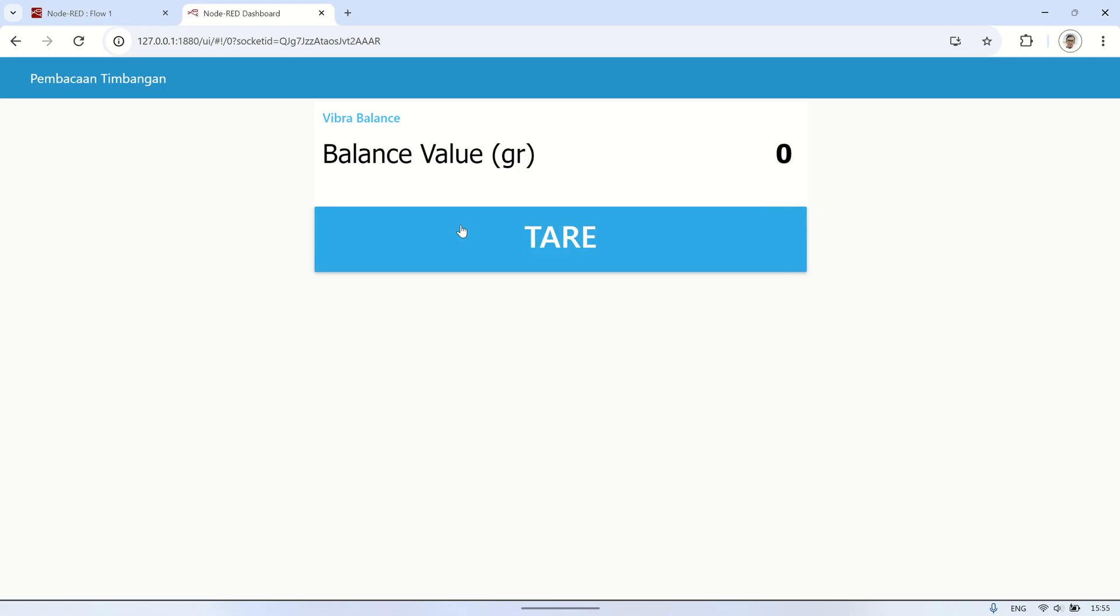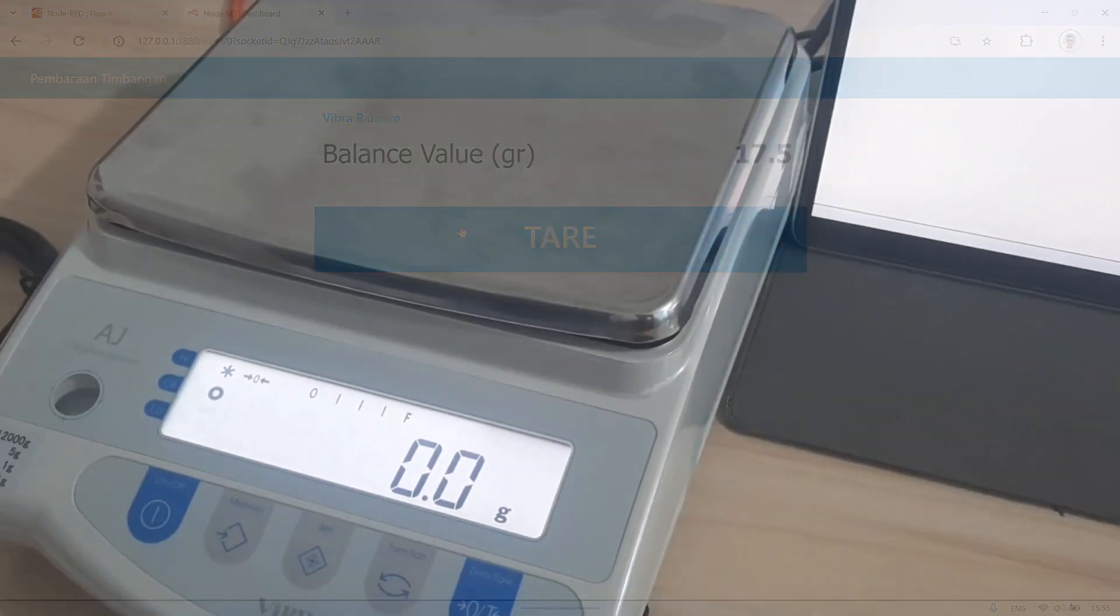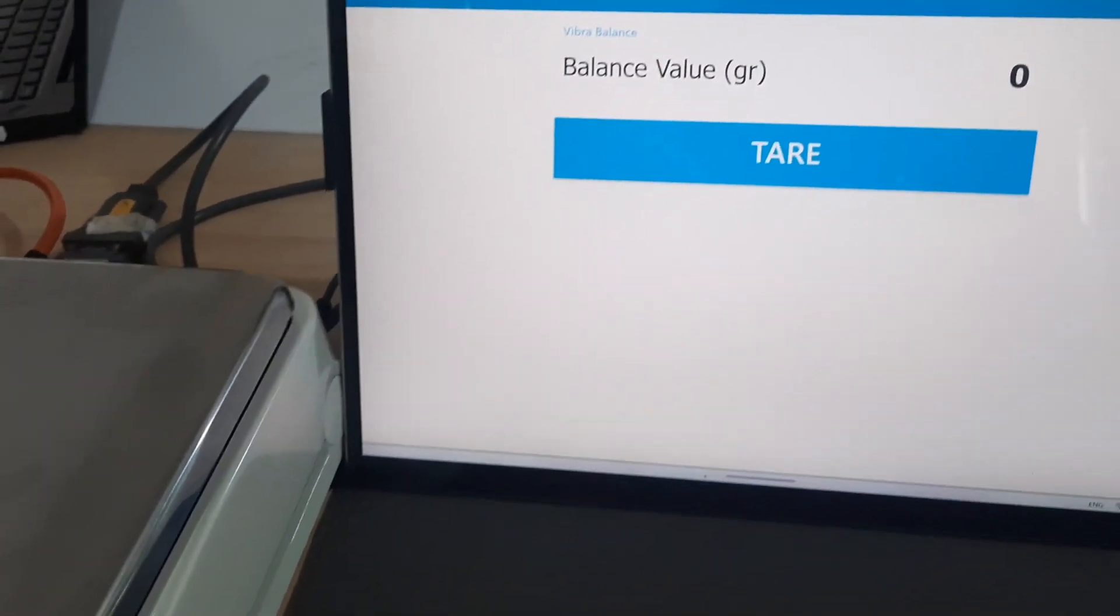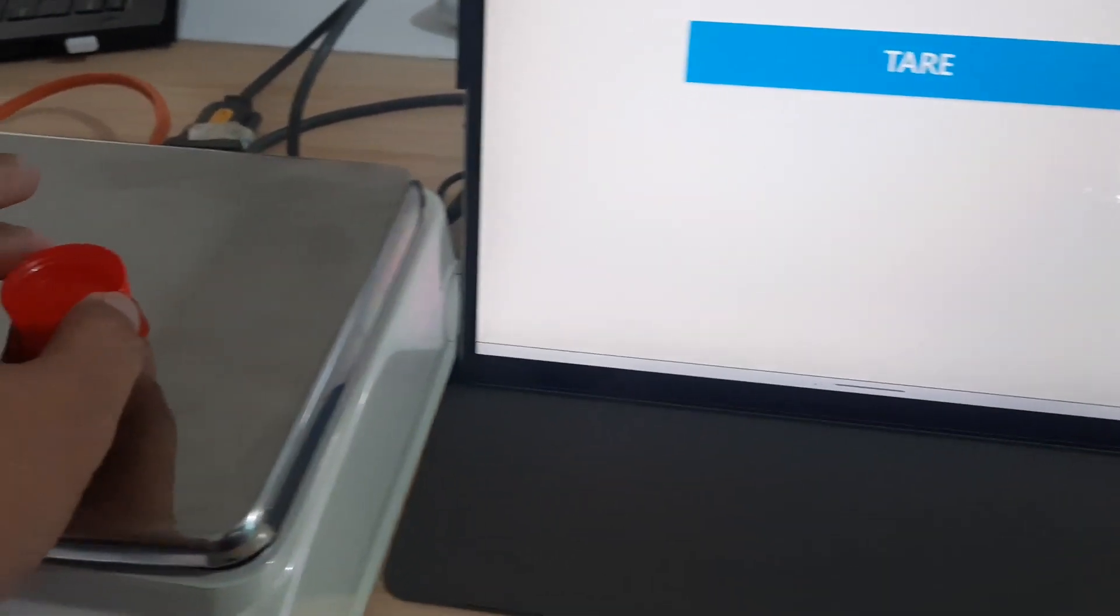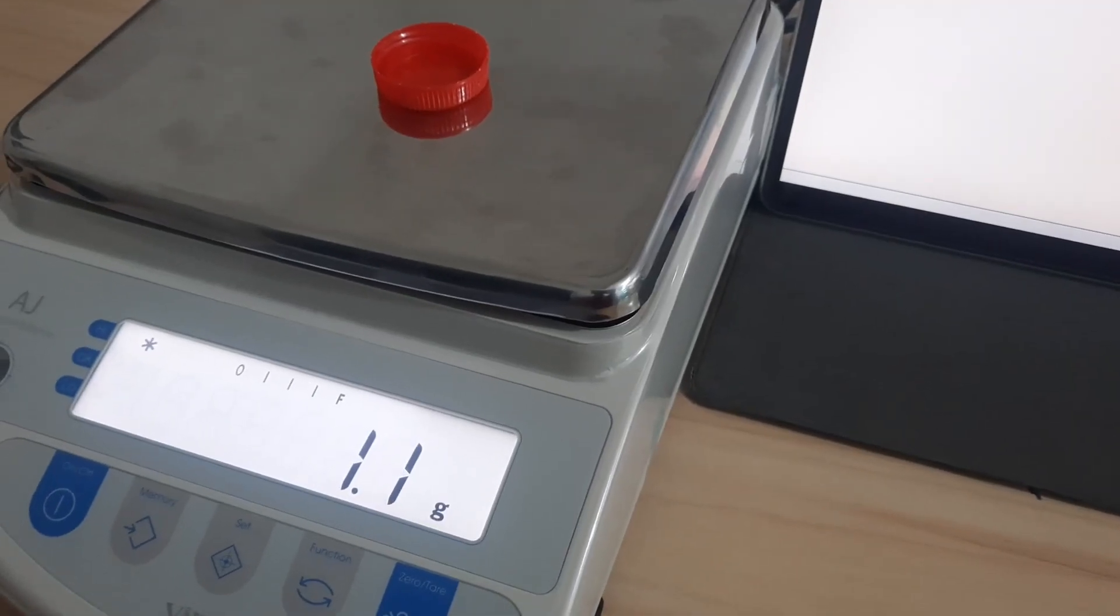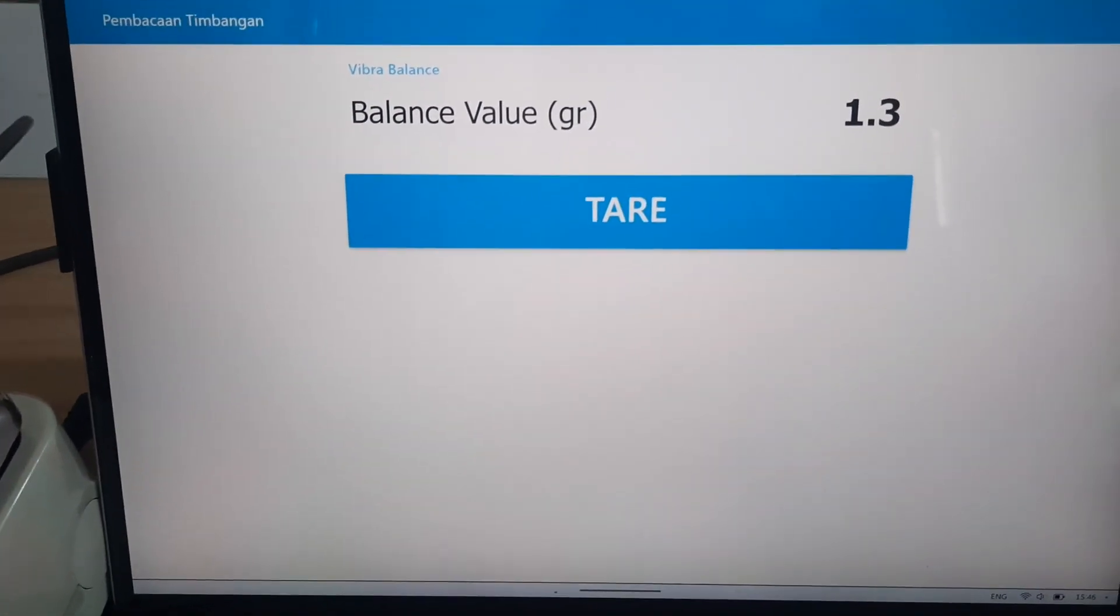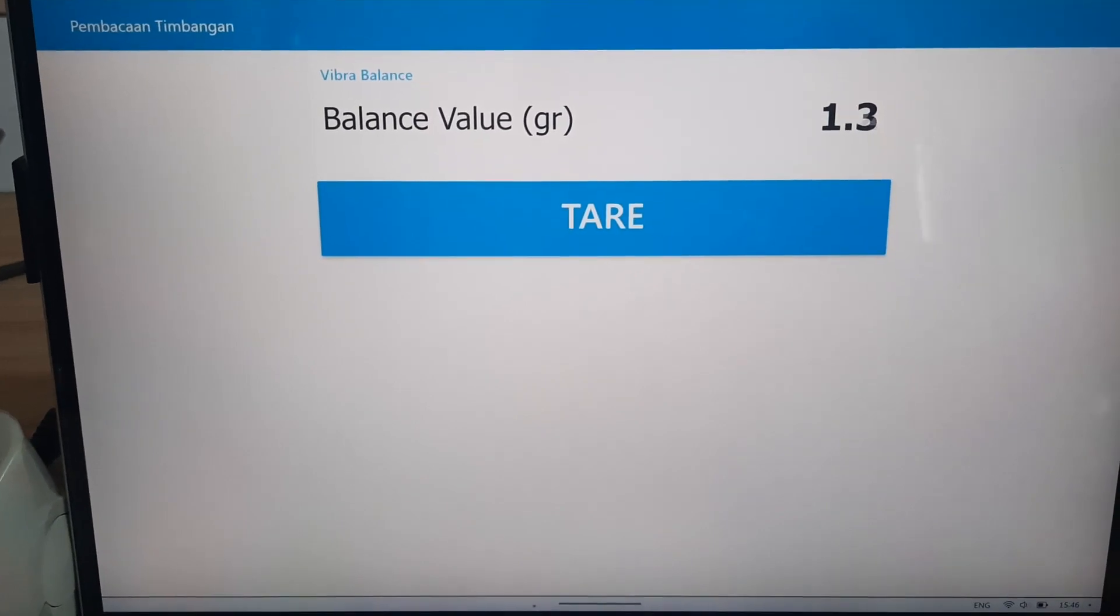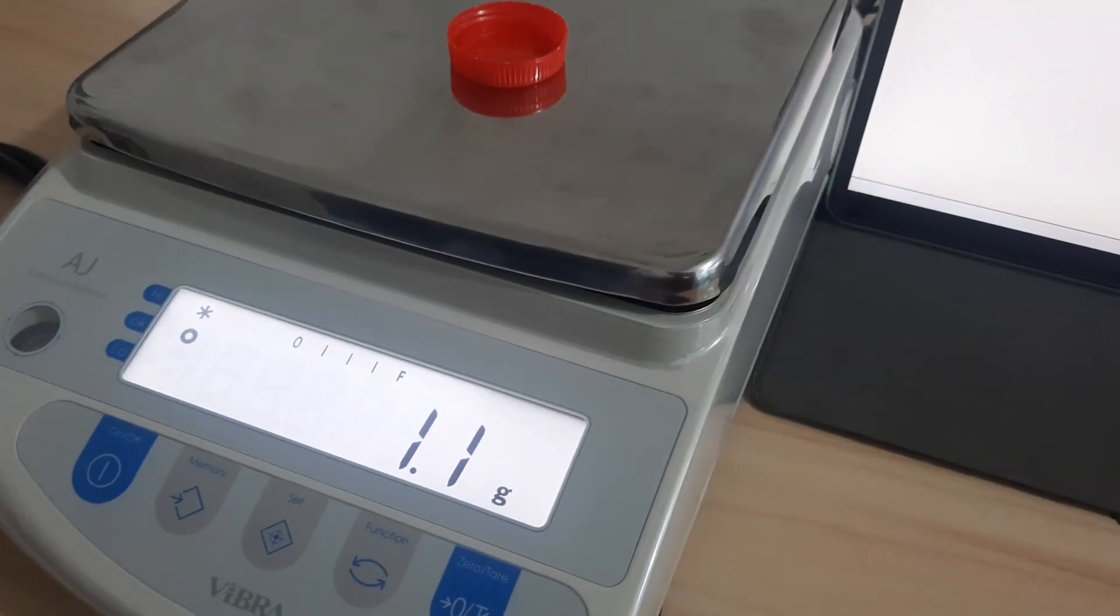In conclusion, this video has demonstrated how to integrate a Vibra analytical balance with Node-RED to display real-time weight readings on a dashboard. We started by setting up the serial in node to read data from the balance, connected it to a debug node to view the output, and then utilized a function node to extract and format the weight values. We also configured a text node to display these readings in a clear and readable format on the Node-RED dashboard.